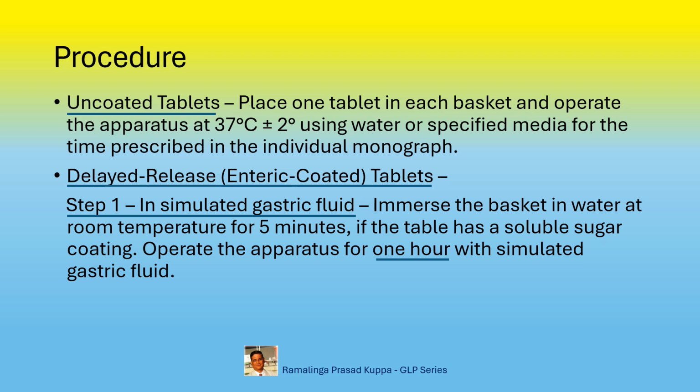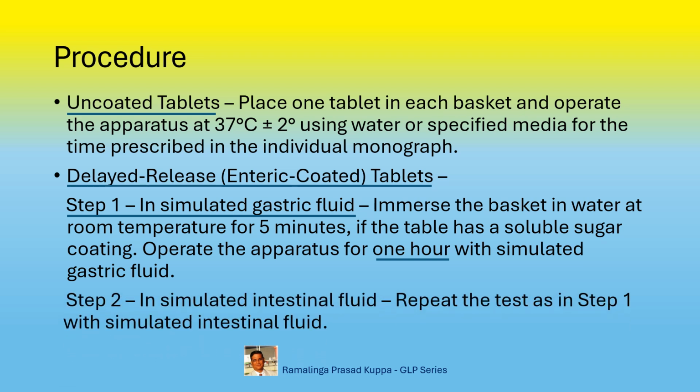Mostly it is 0.1 molar hydrochloric acid solution. In this step, there should not be any evidence of disintegration, cracking, or softening of the tablet. It should be understood that the delayed release tablets should not get affected in the gastric fluid of the digestive system and pass into the intestine where the therapeutic activity is expected.